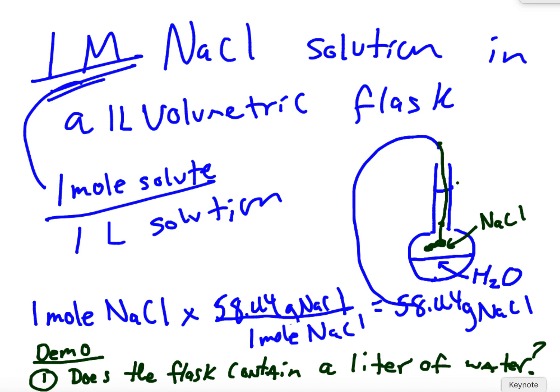Okay, so now I'm going to continue this example with still NaCl, because then you're going to do it with a few other solutes.